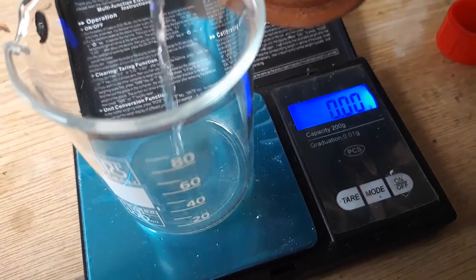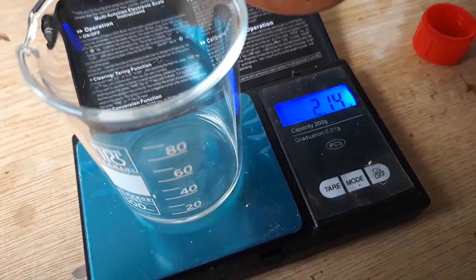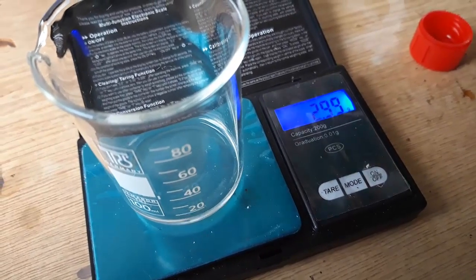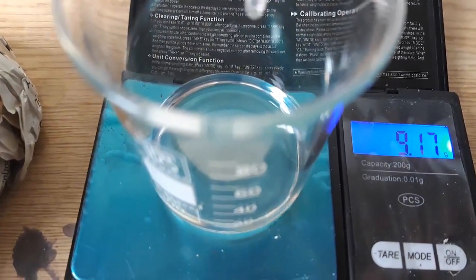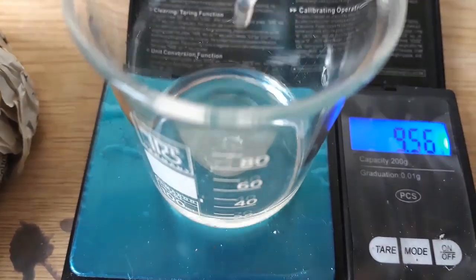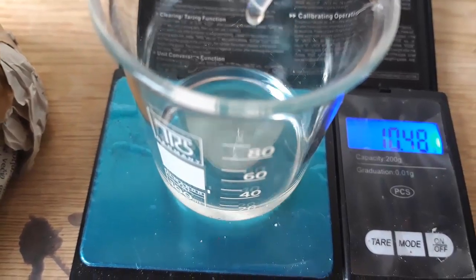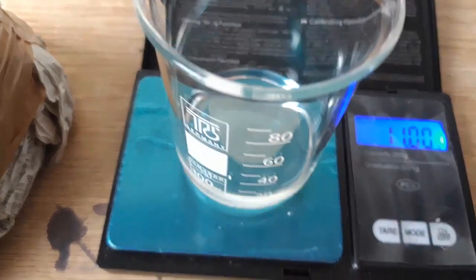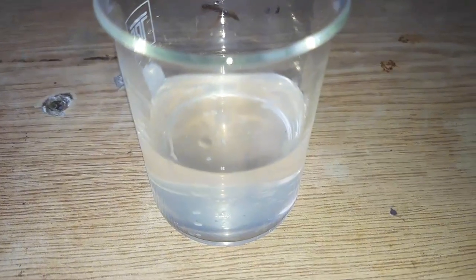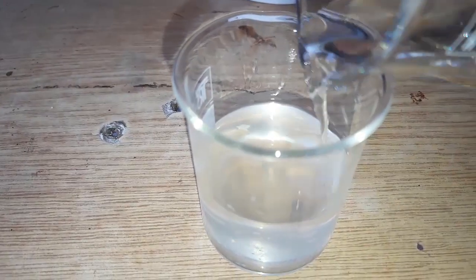In a separate beaker, weigh out 2.9 grams of acetone and then add to it 10.9 grams of benzaldehyde. Add the acetone-benzaldehyde solution to our basic ethanol.